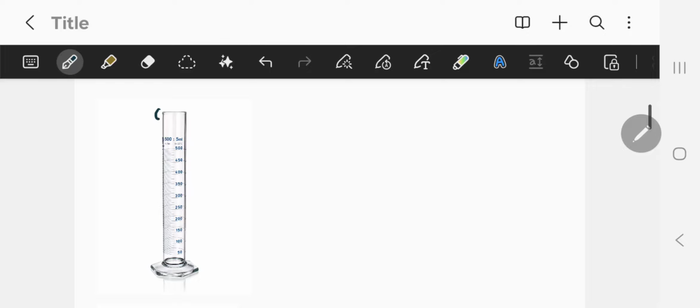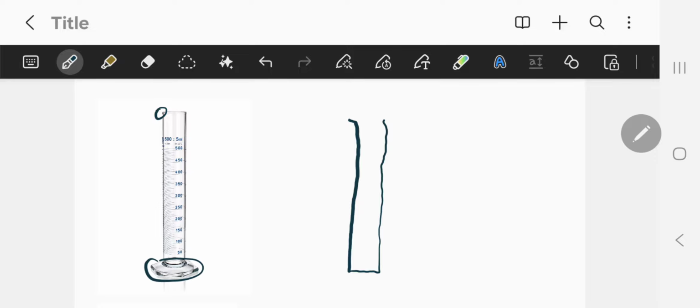You've got a spout there, I don't know if you can see it. Little spout coming out, and then it goes straight down like a tube. It's flat there, and it goes all the way up. Okay, my drawings are horrible. Okay, but you get the idea, I'm sure. So straight up like that. And then here, it goes like that, like a trapezium. Okay, trapezium looks like that.